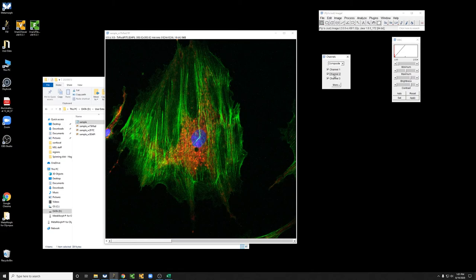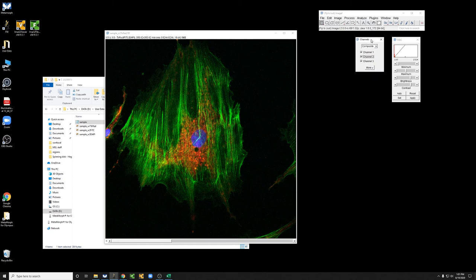So if you need to do more with Fiji than just these very basic operations, I will eventually either link to or make a video with very basic things that you can do here.